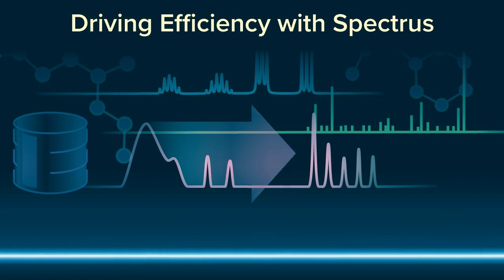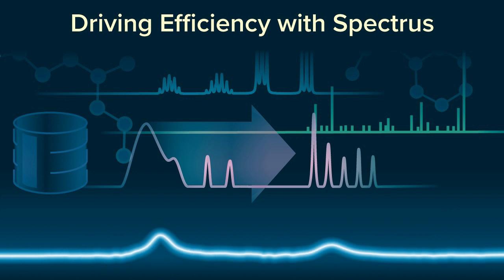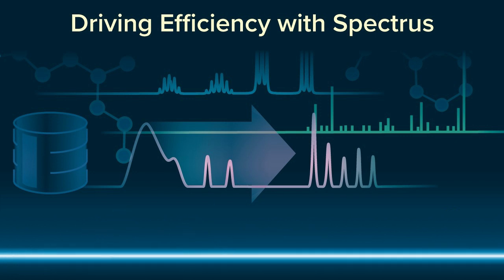With regards to the storage of the data, which we get into a nice and minimal format, we use a unified database solution from ACD/Labs, and here is the basic description of it. We actually store all the data obtained during the process that I described previously. So it's LCMS and NMR. We store it all in the same place. This data is accessible to everyone and can actually be mineable.